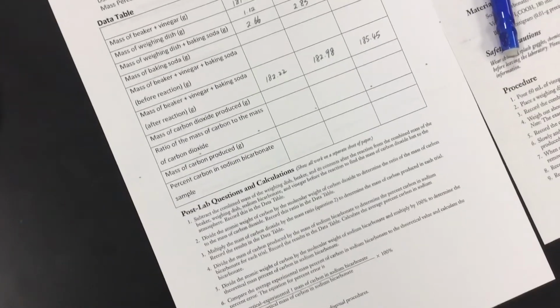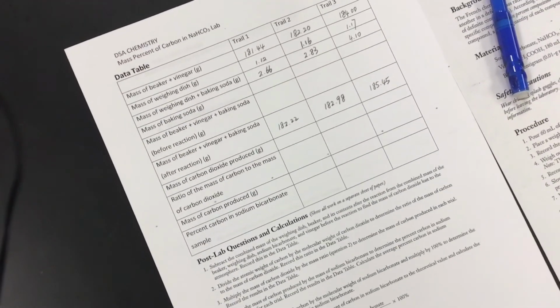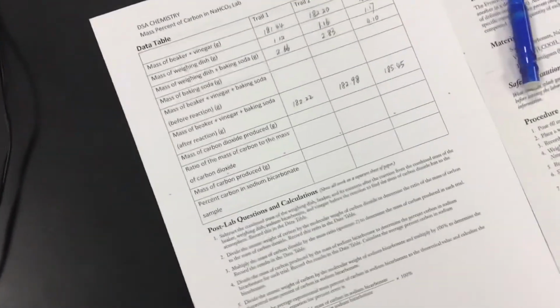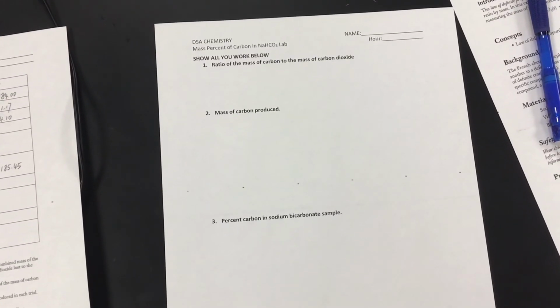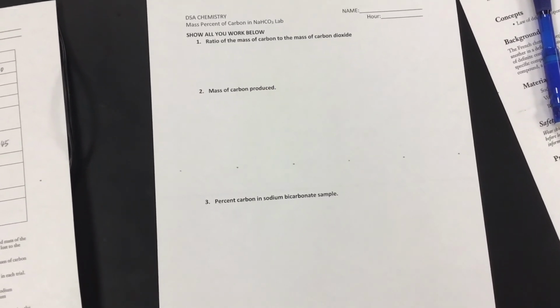Be aware, you also need to read through the post-lab questions and calculations that will help you fill in those blanks. And on the last page, you do need to show all your work there, such as the ratio of mass of carbon to the mass of carbon dioxide, mass of carbon produced, percent carbon in the sodium bicarbonate sample, and also the percent error.